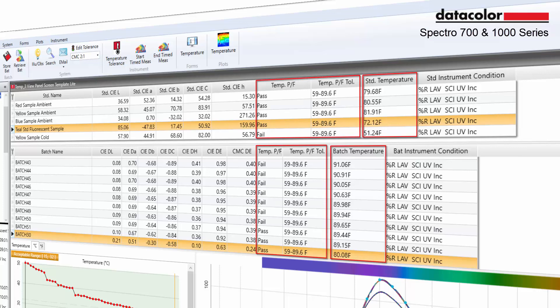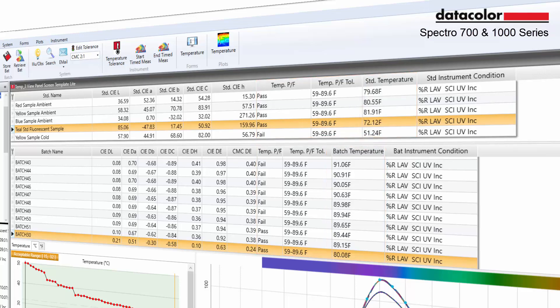These fields can be added to any grid and will allow the user to see whether the sample falls within the temperature range.